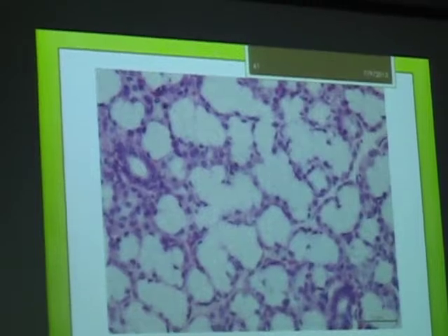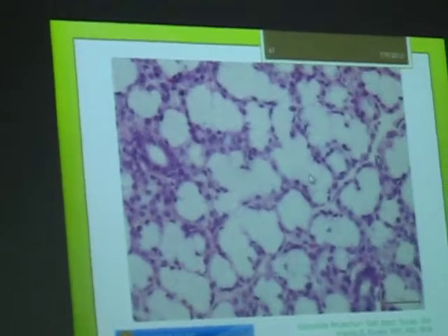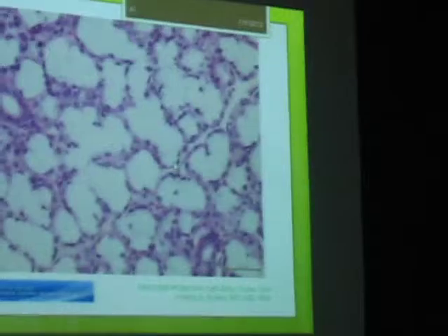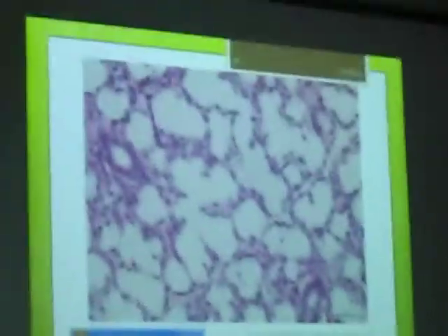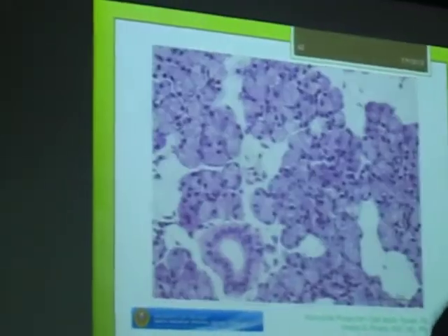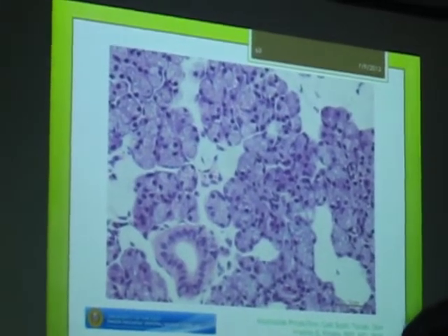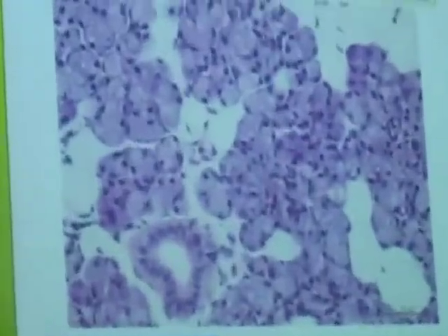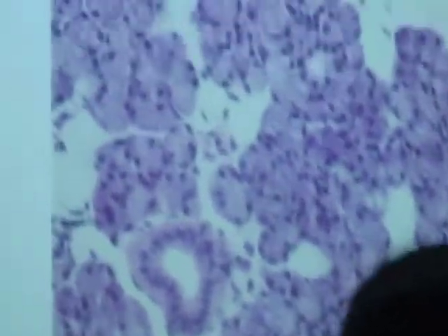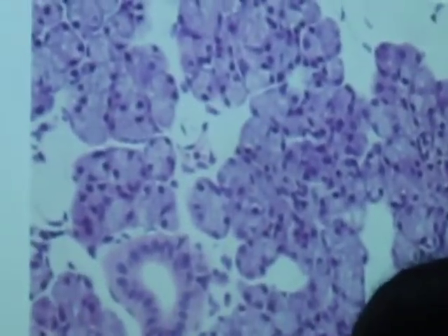Okay, so this is from the sublingual gland. Okay, so mucus, clear cytoplasm, the nuclei are pushed to the basal part of the epithelial cell. Okay, classify according to the nature of secretion again. Classify according to the nature of secretion.